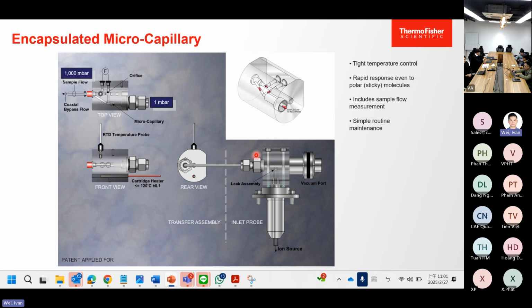The final pressure reduction is provided by a glass-drilled leak element. It's right here, as you can see. So this is only for Prima Pro. If we are monitoring using Sentinel Pro to do environmental monitoring, this pressure reduction feature will be set differently. The whole process is we're trying to reduce the pressure, so your sample gas will go into a vacuum phase where we are able to do the monitoring.